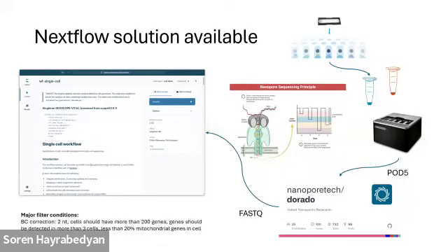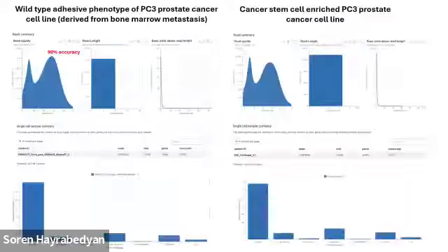So we selected all cells that have at least 200 genes detected. And each gene should have been expressed in at least 3 cells. And we use the standard of 20% mitochondrial genes in a cell. Otherwise, we filter.